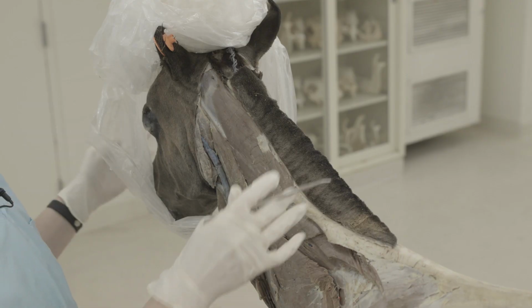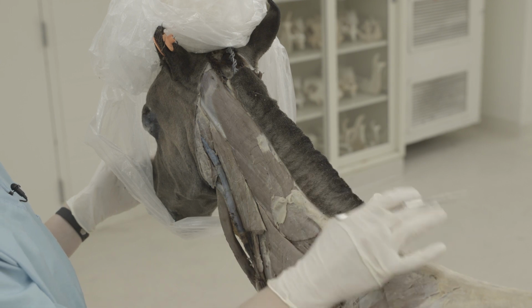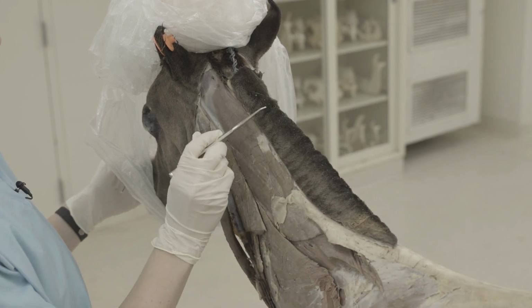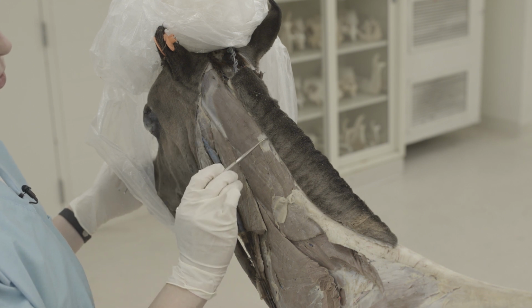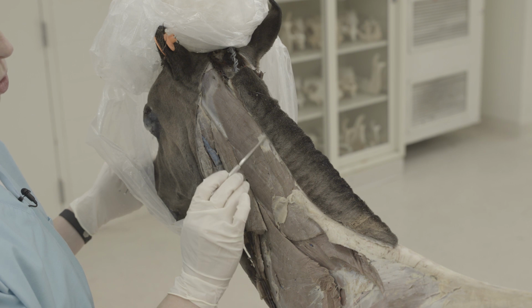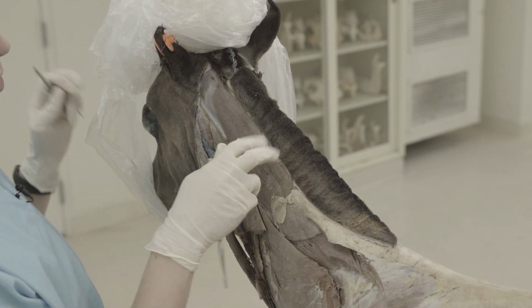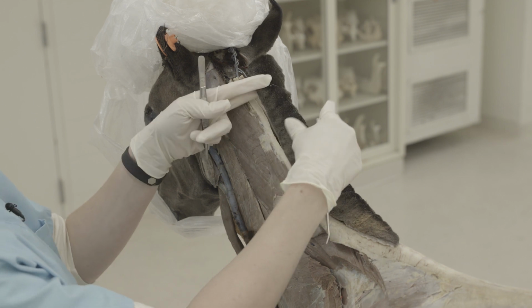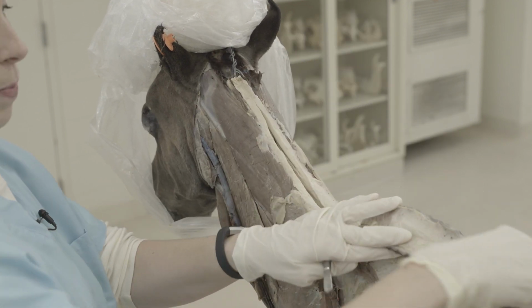So now we're looking at the caudal aspect of the neck of the pony here along the back. So you're going to look at this for the nuchal fatty crest. You've already identified it, but you need to actually reflect the nuchal fatty crest. So that's just this part of the mane. Just deep to the mane is the nuchal fatty crest, the fatty part. And so you want to carefully reflect that all the way back. So you're going to take that back like that.